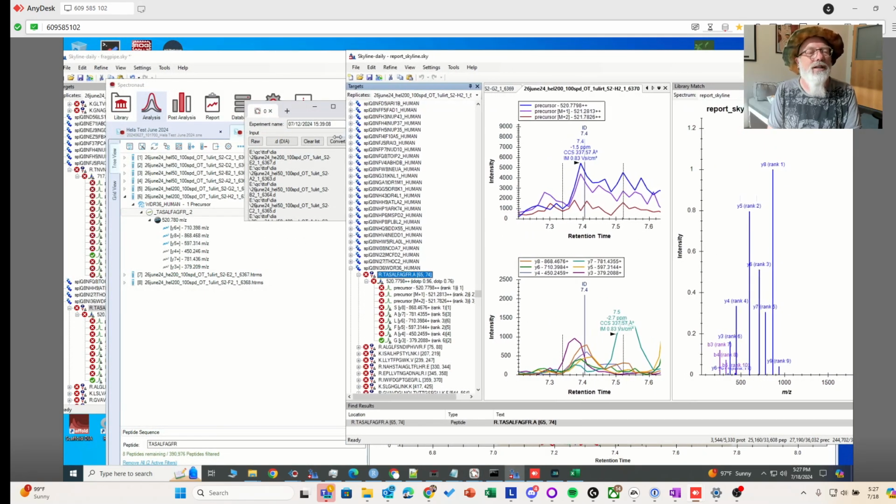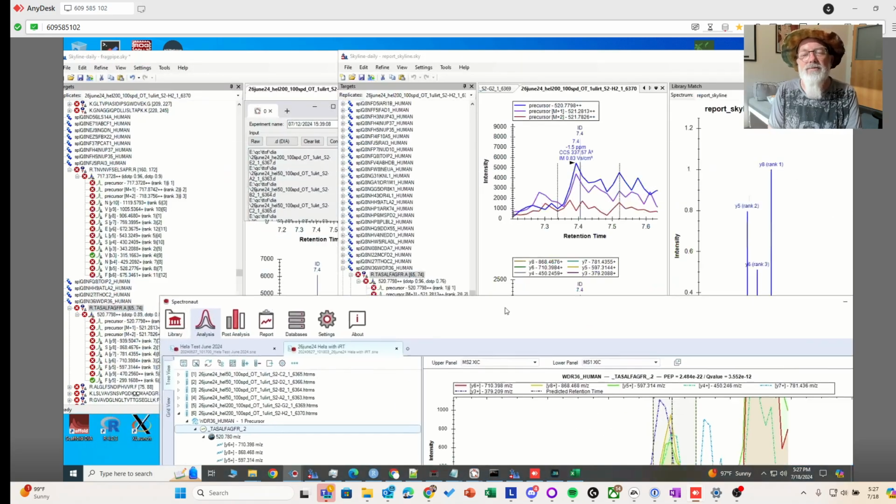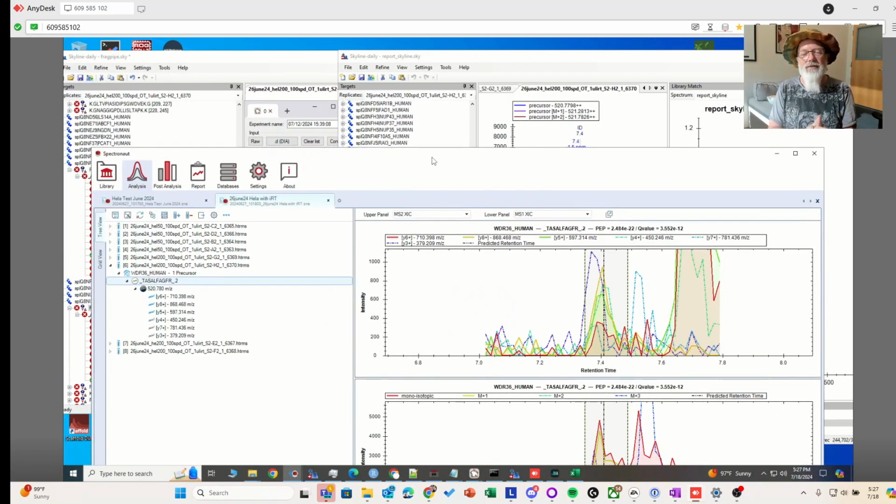And if we've generated Spectronaut data for you, you can see if it matched. So that'll be super fun. So I would recommend when you get data from me, get the raw files or the .d files and do this procedure yourself. View it on Skyline and try to see if you have any questions. It's the best way to learn what data independent acquisition is, the type of mass spectrometry proteomics nerds do now.